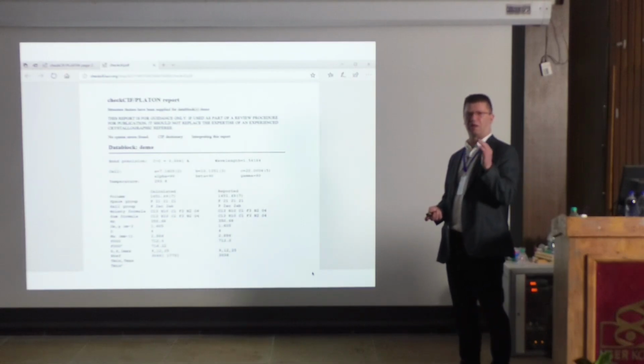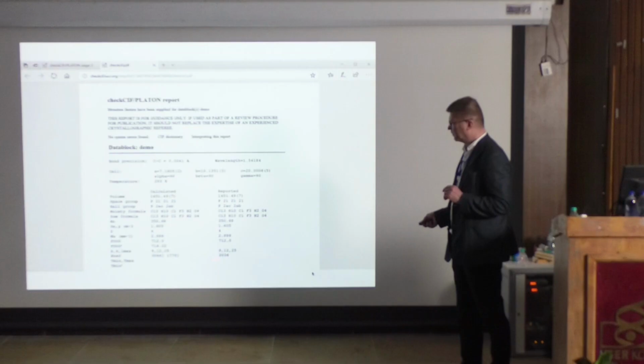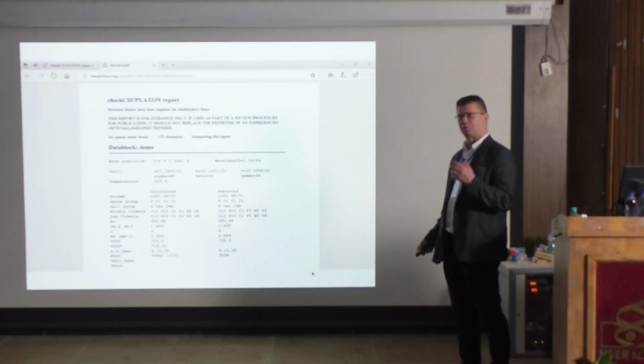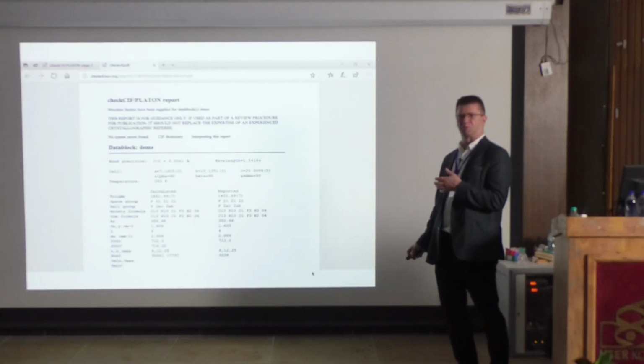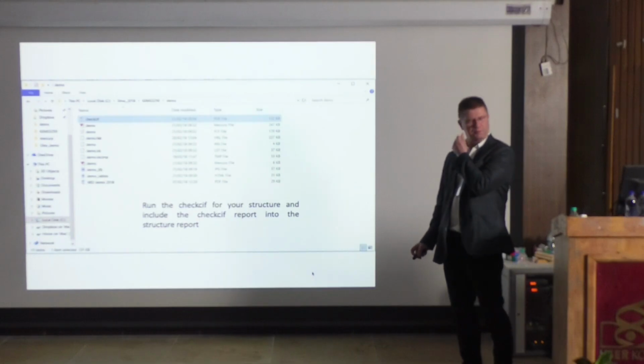So the instrument has not been able to measure these 8, but this is not a big thing. If there is a big difference here, then the program will start to give warnings, that you have not done something correct, something is missing or is incorrect. So that is why it is important to do this report.